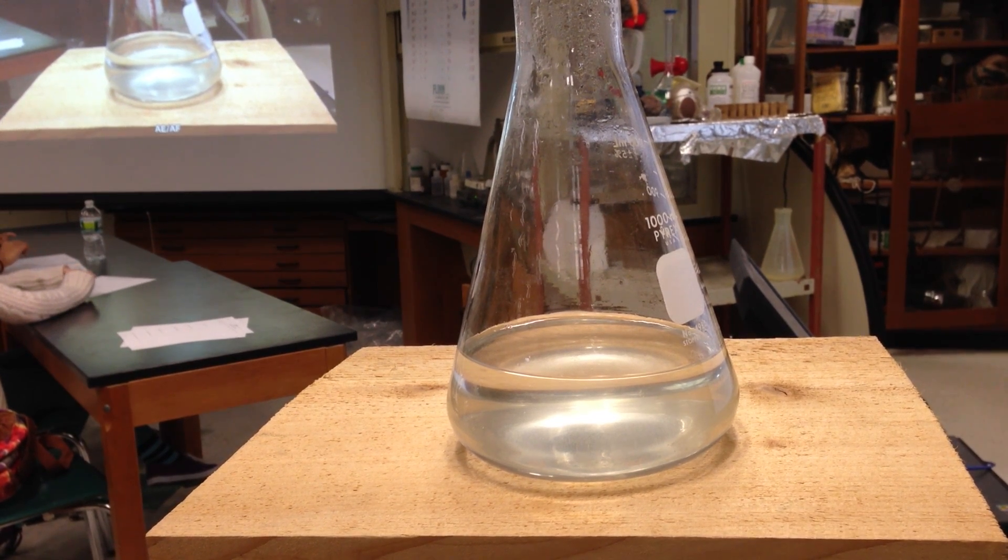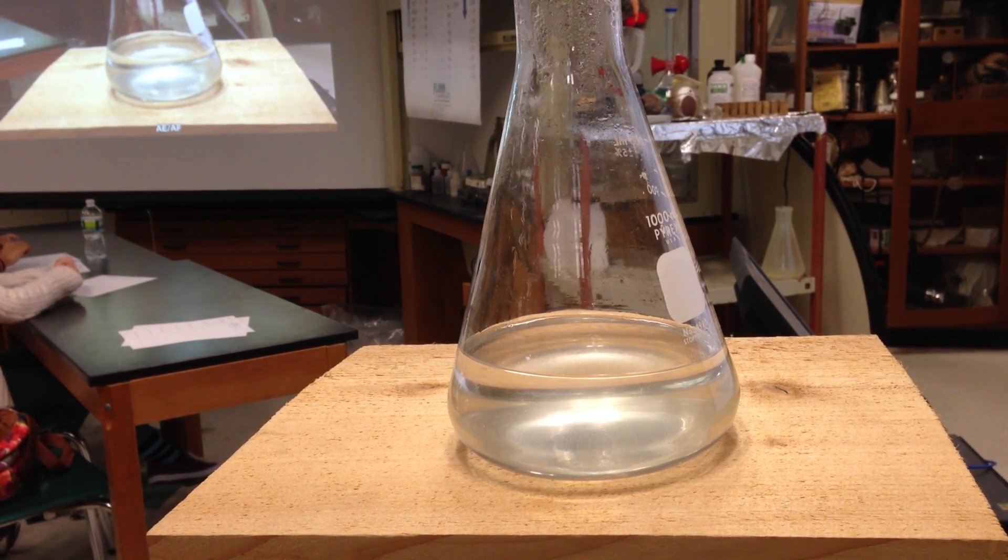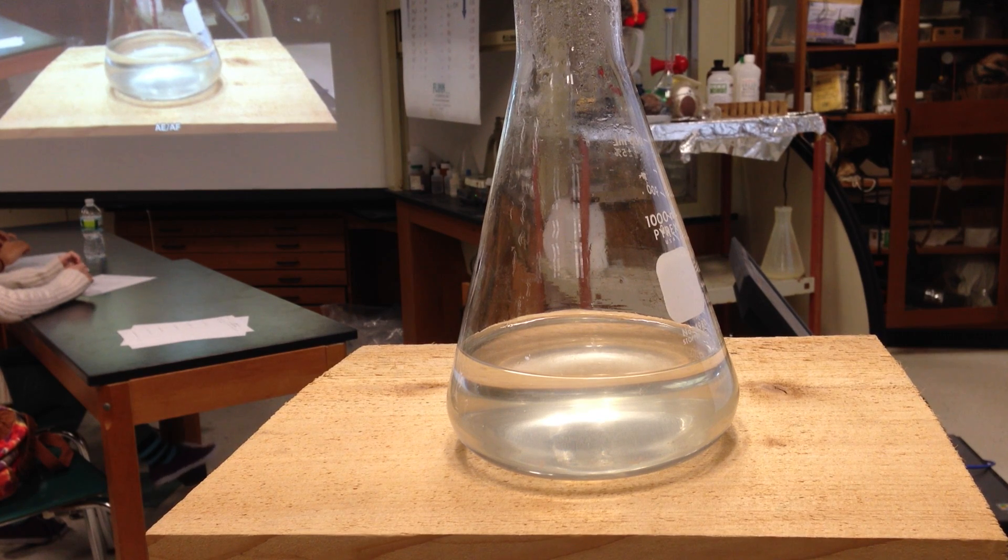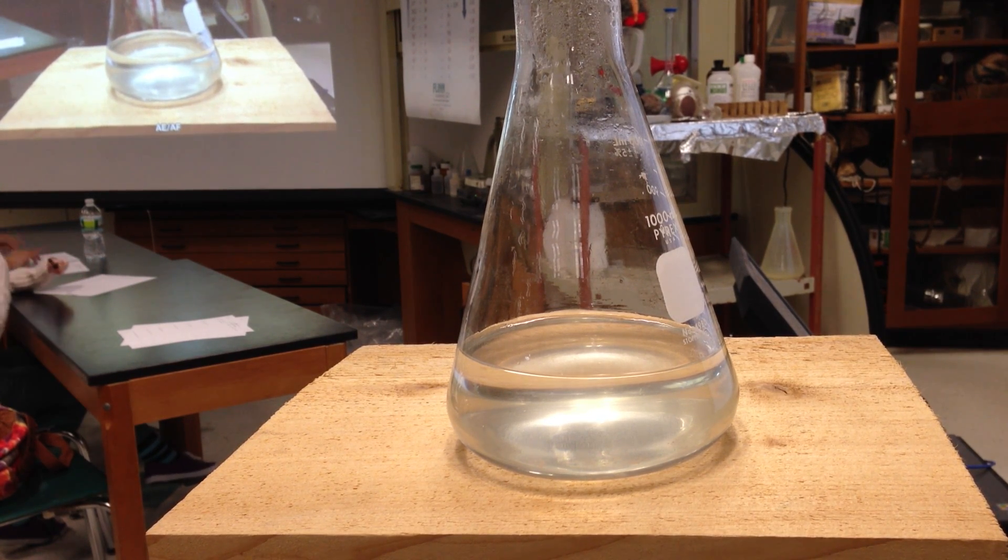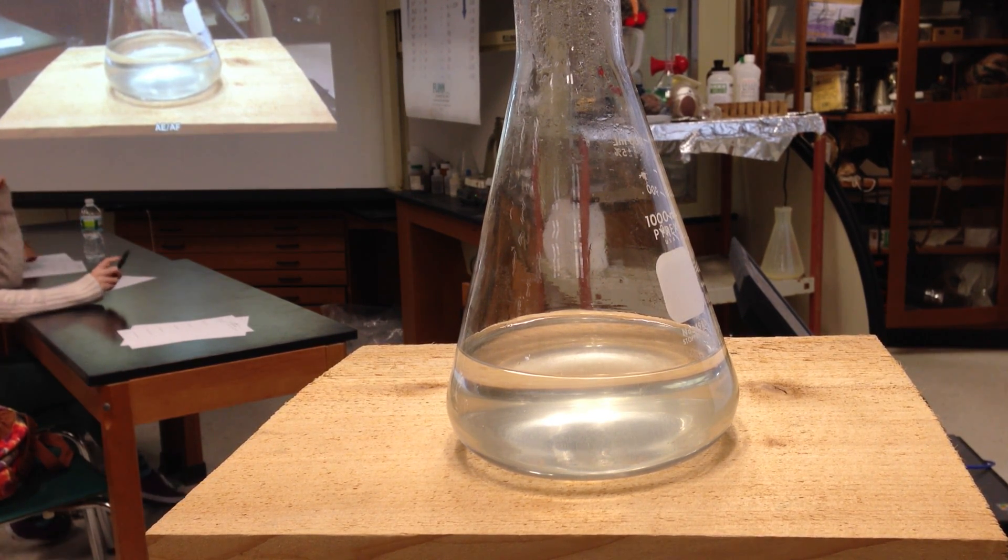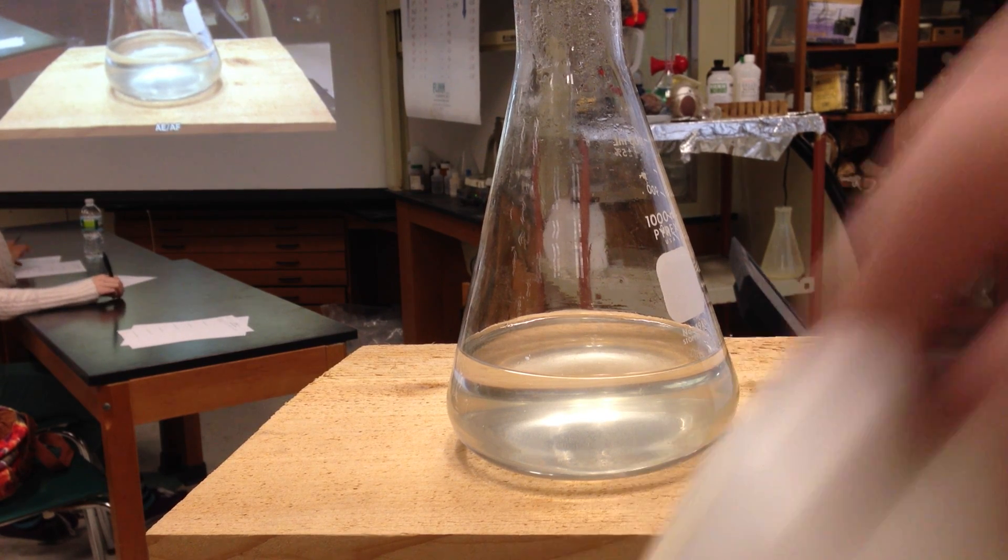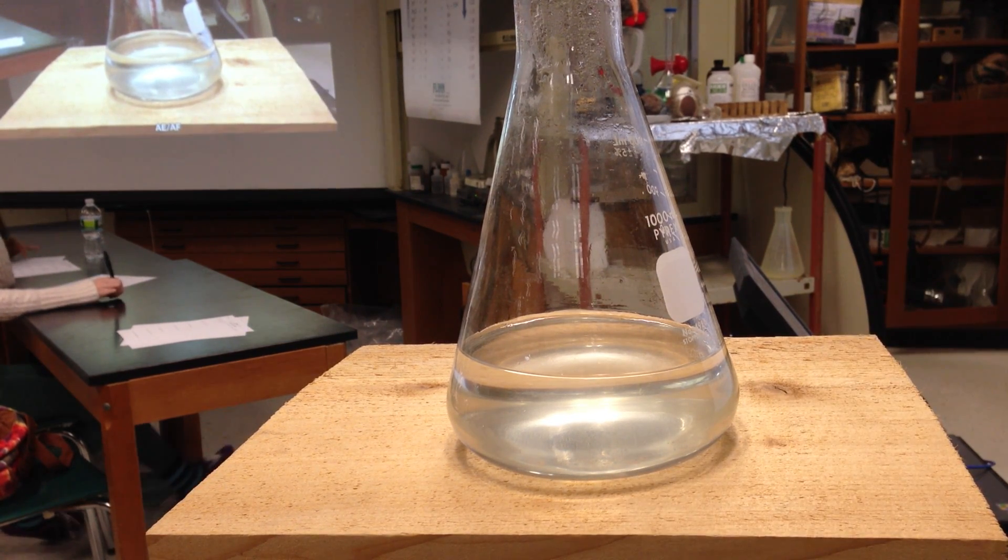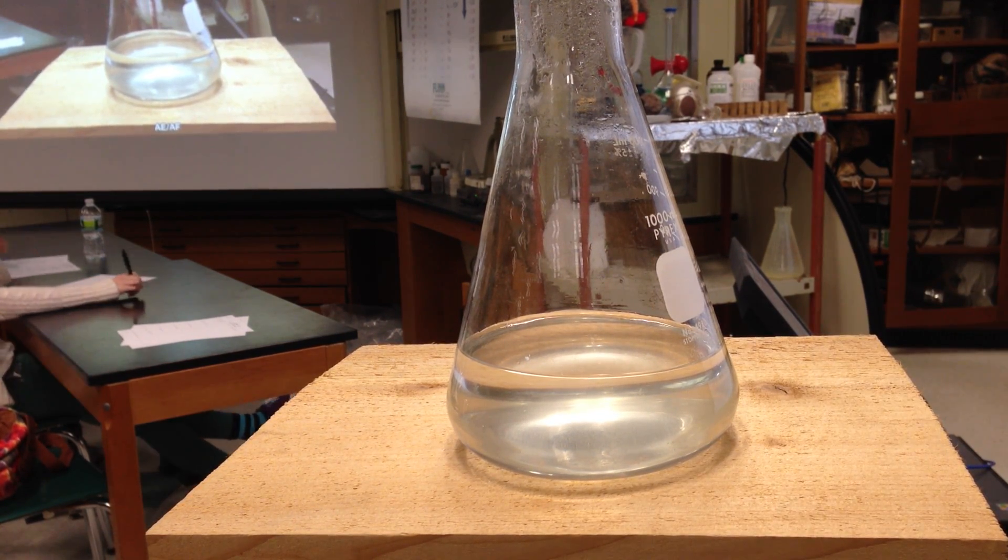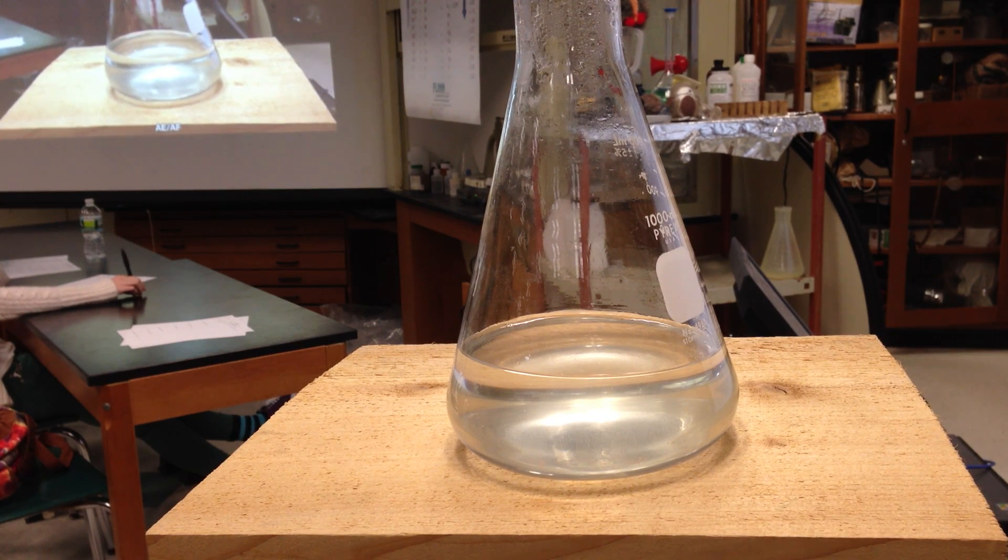So what I have here is a supersaturated solution in this big 1-liter Erlenmeyer flask. And what I'm looking to do is, hopefully if I made this right, be able to show how this supersaturated solution actually will come out of solution as I pour it.